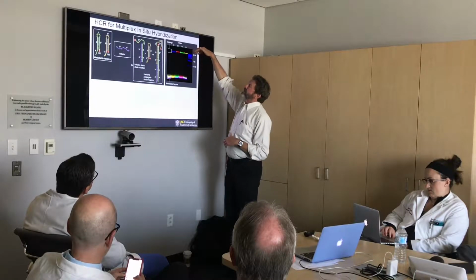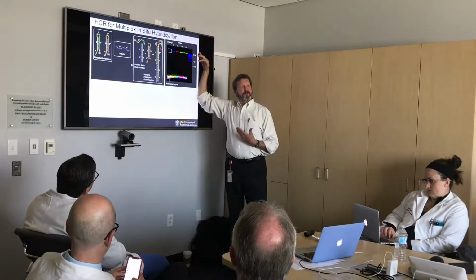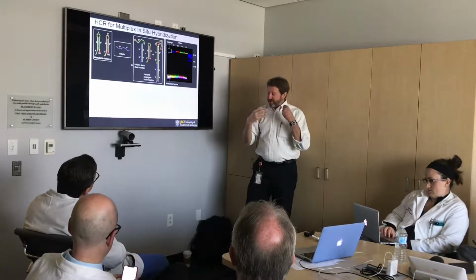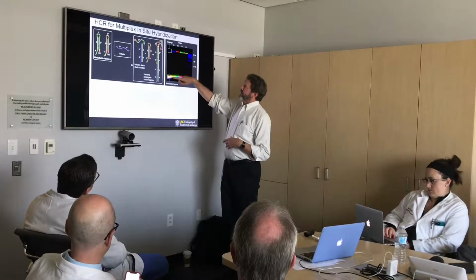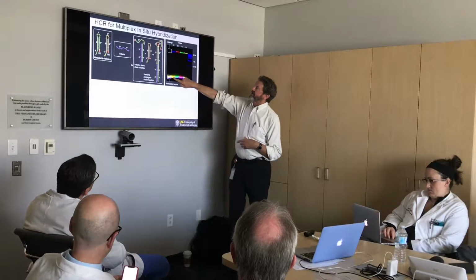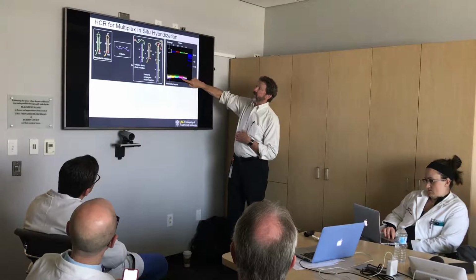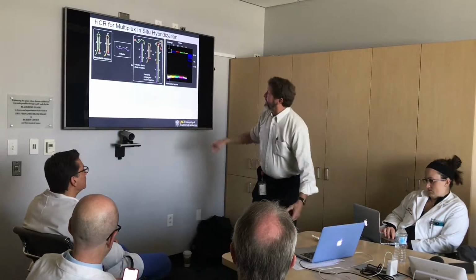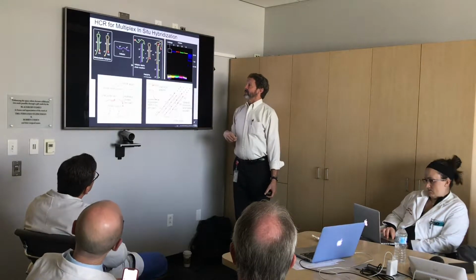So here are 4 hairpin pairs, and the hairpin pairs in this case are labeled with different dyes. If we take all 4 of them and throw them in a tube and add blender extract of tissue, they still run in this gel as these little hairpins. If I add the blue initiator, blue disappears from here and appears up there. Add the green initiator, it appears up here and disappears from there. So we've got the ability to amplify from a 1 mer up to a 200 mer in a sequence-specific way.